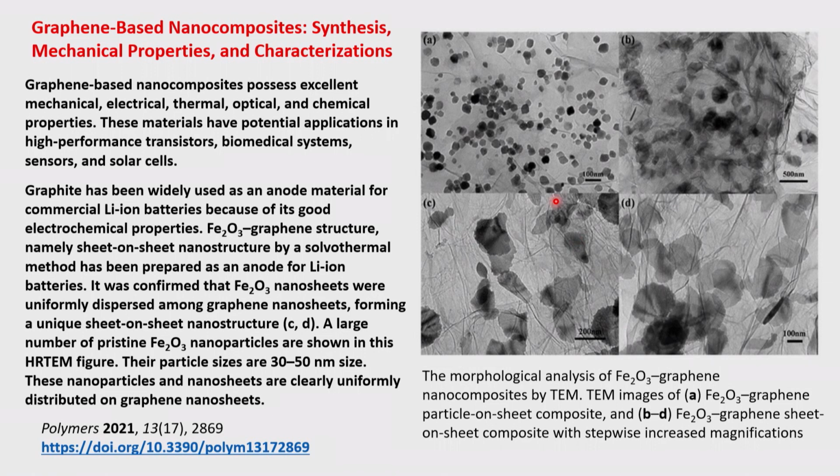You can see the background, these are the graphene sheets, and these dark spots are your Fe2O3 nanoparticles. So this is a composite. Nanoparticles got embedded into the graphene nanosheets. That is where you look for certain properties, thermal stabilities, better mechanical and better electrical properties. These are the reasons why you put a sheet on a sheet, and then you have your nanoparticles in that.